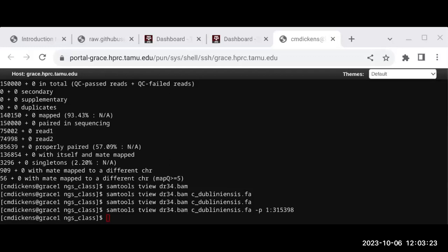Okay, so if you're doing a haploid, you're going to see this in almost all of your variants. It's going to be because you only have one chromosome, right? Unless you have a mixture of your target organism with a closely related one that doesn't have the variation. But generally for diploid, you're going to see something like this.